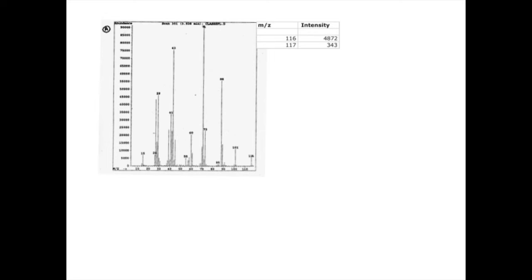Here is a real mass spectrum. We'll assume that the molecular ion is in the high mass cluster. I've included a table of the intensity data for this group of peaks. Let's assume that the molecular ion appears at mass 116. There doesn't appear to be any bromine or chlorine or other important A plus 2 elements. An even mass for the molecular ion suggests an even number of nitrogens.